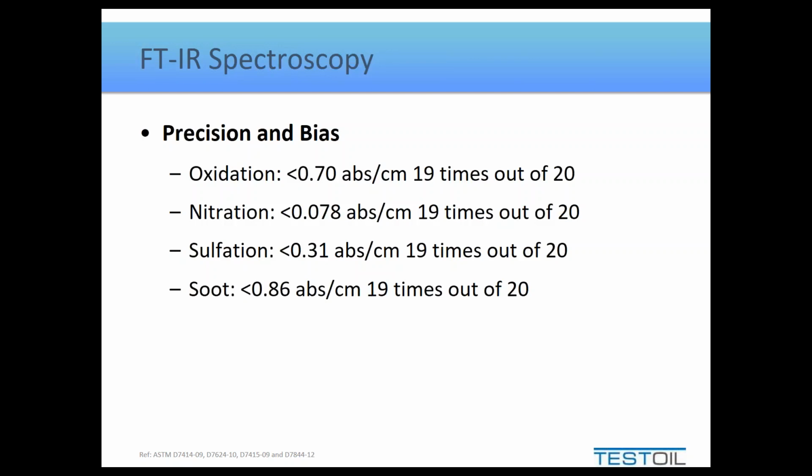So typically the numbers are reported as whole numbers. They're not reported with decimal values, and this test is accurate into the decimal values. So yes, you can look at a change in results as being a realistic evaluation of what's going on in the system. That's the long and the short of it, though you don't necessarily see ASTM procedures for each and every parameter that are reported.